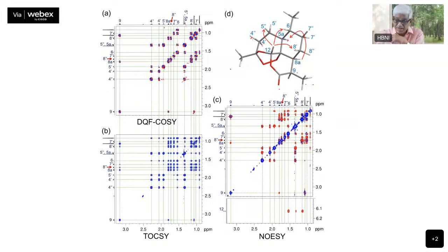So if you obtain any other coupling information, it should match with this. You get a little one here, which is to the 8 prime. You also get one small one here, and that is to 8 double prime. You see, go this vertical line there, 8 double prime. So 8A to 8 double prime. You are seeing 9 to 8A direct peak and the relay peak to 8 prime and 8 double prime.